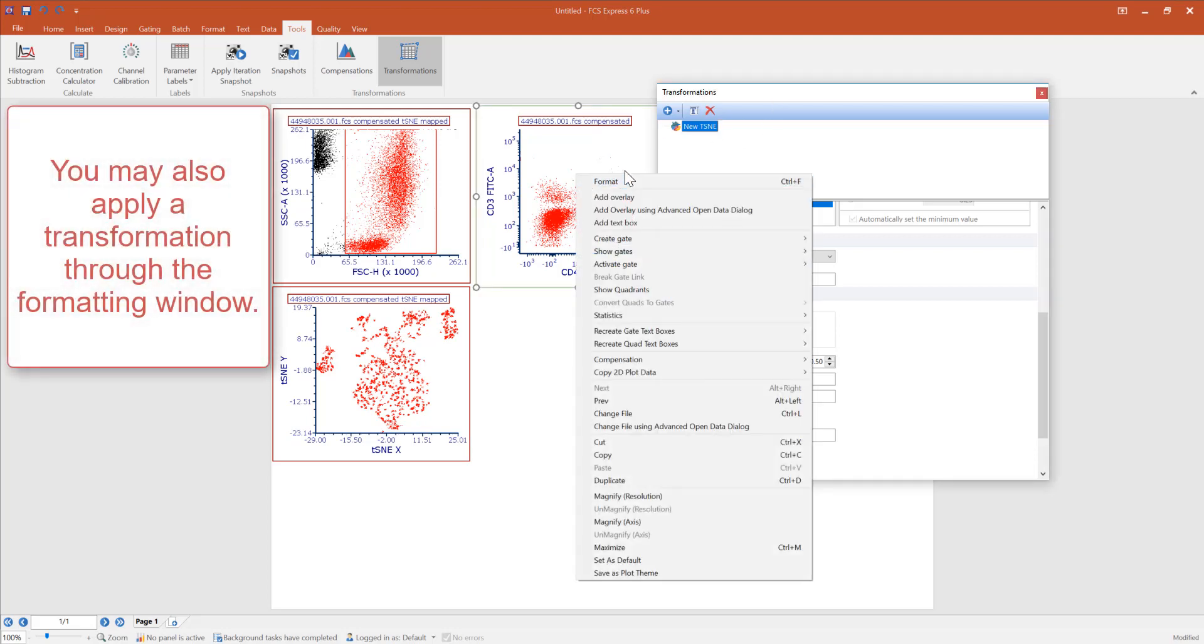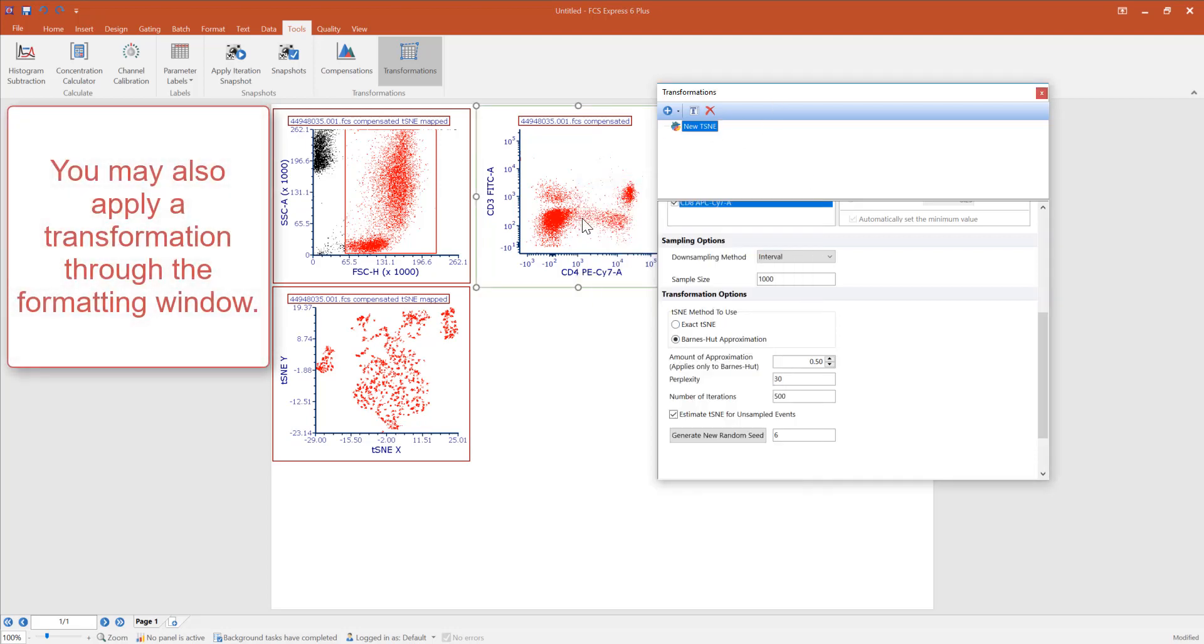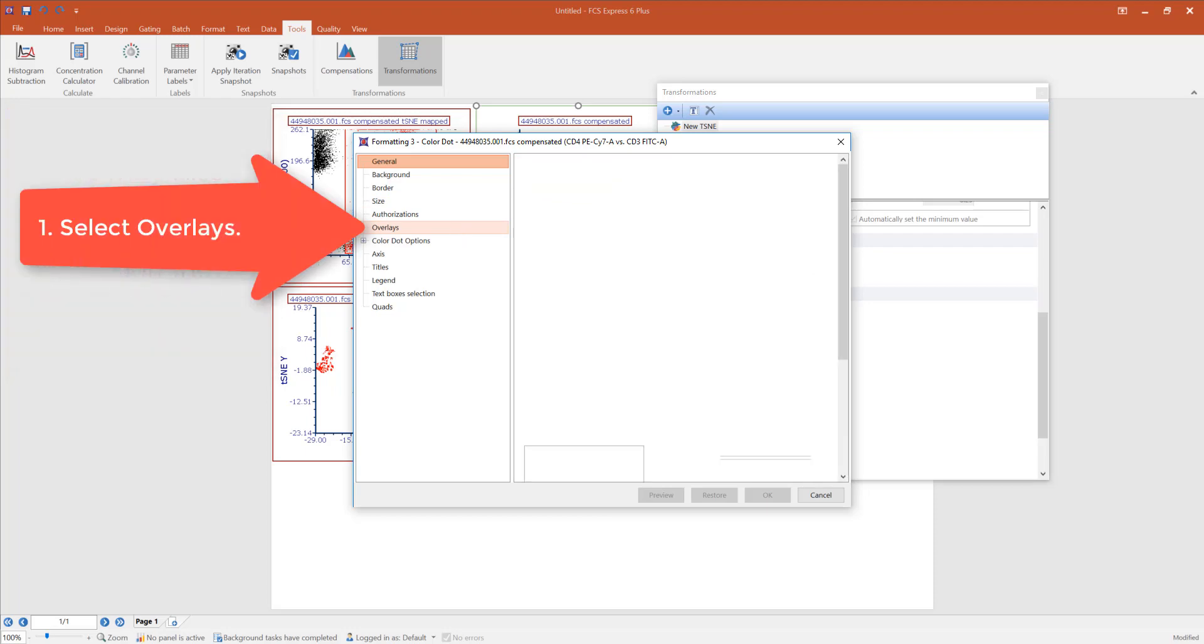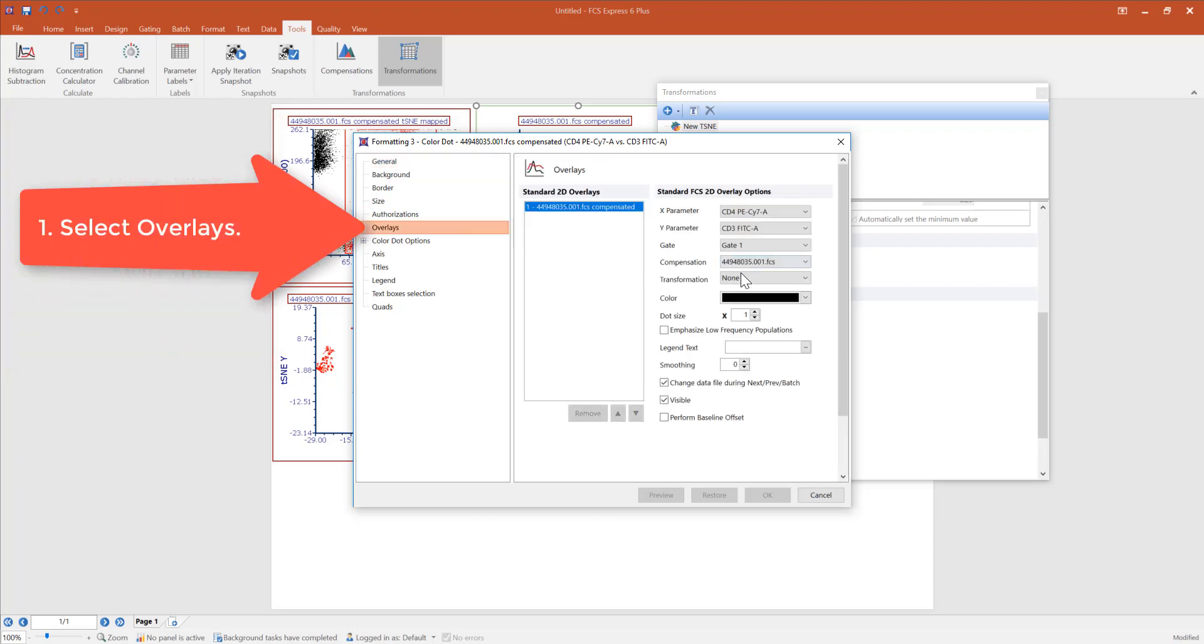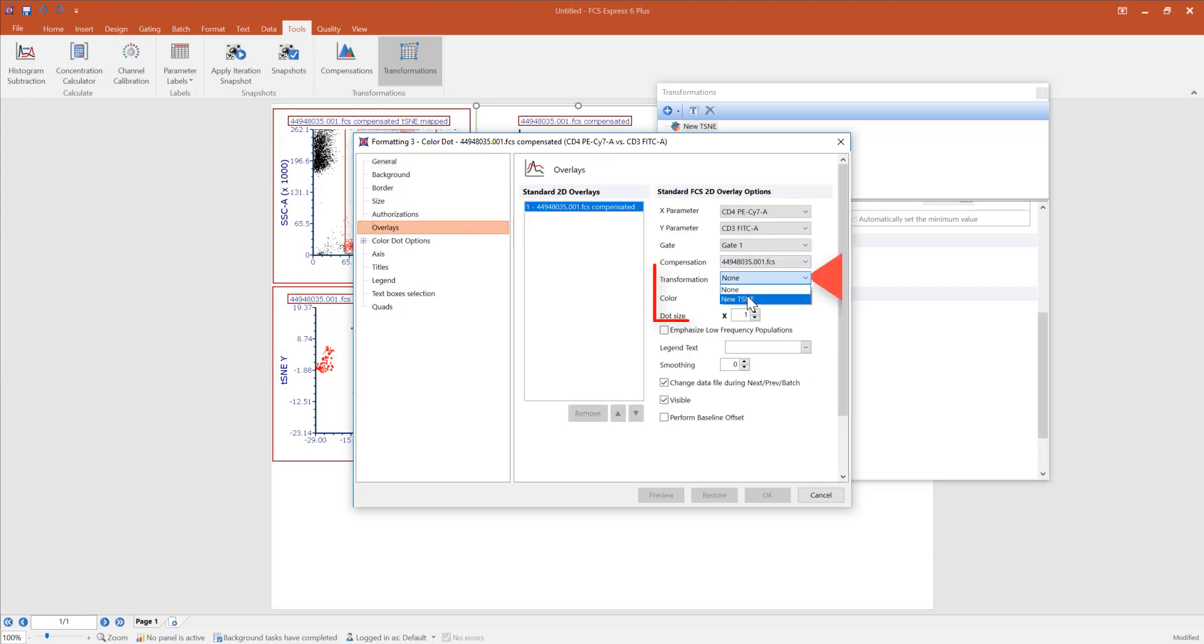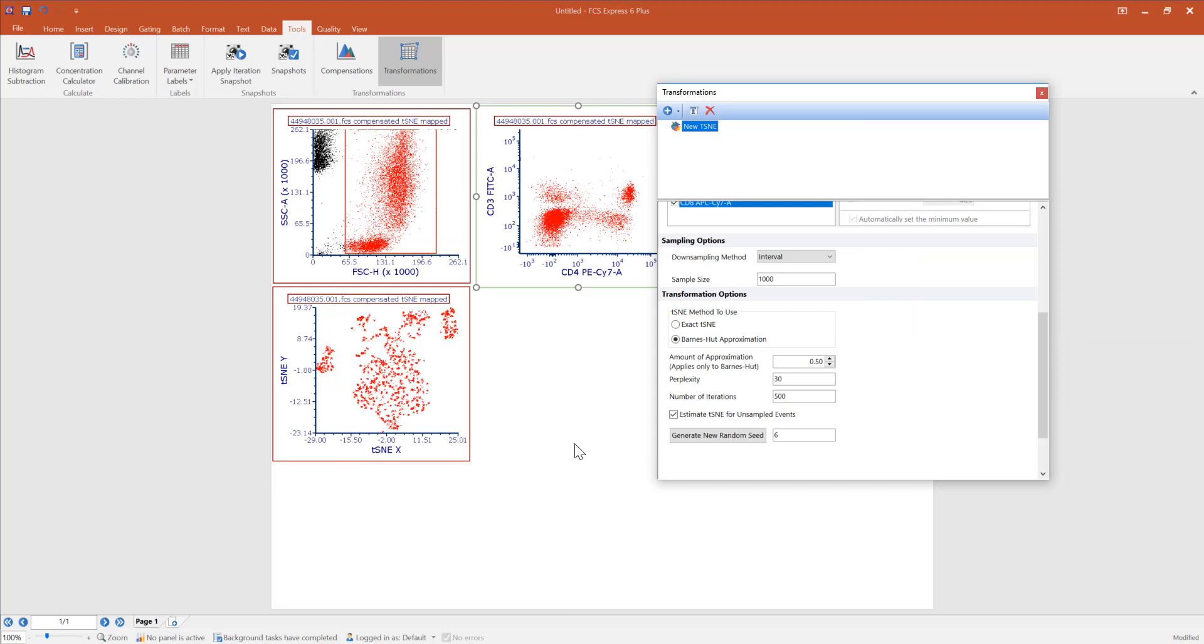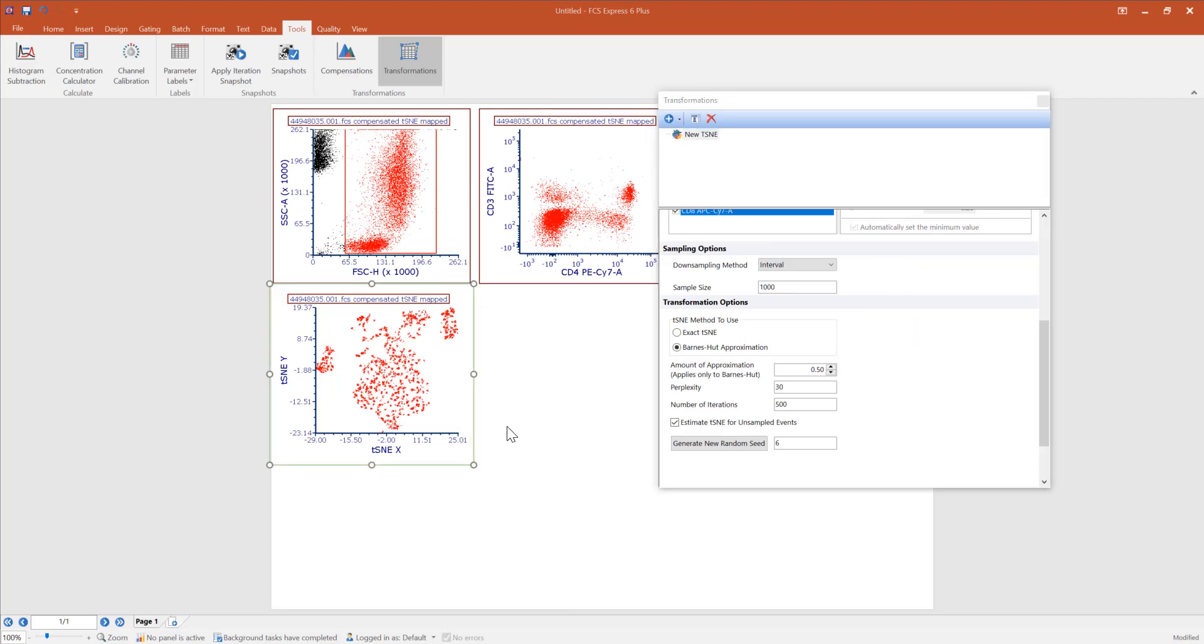You may also right click or double click on a plot to open up the format window. Under the overlays tab, you may select the transformation to be applied to the plot. Once you click OK, the title reflects that the transformation has been applied.